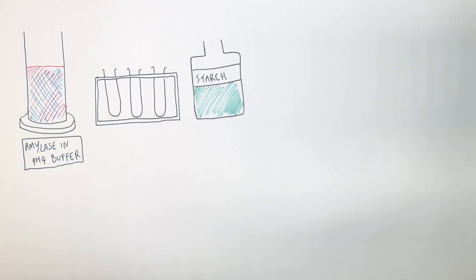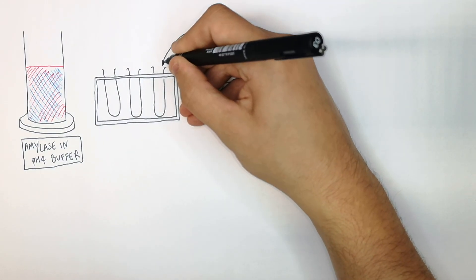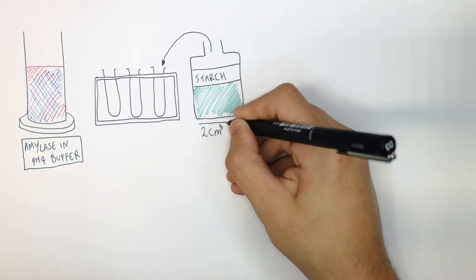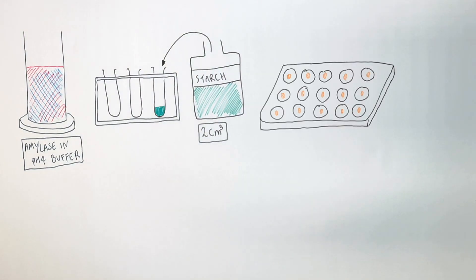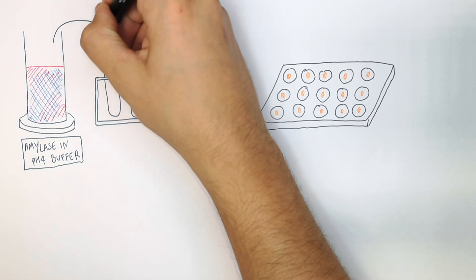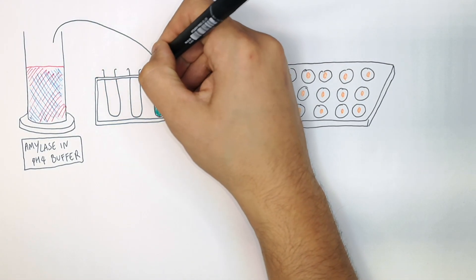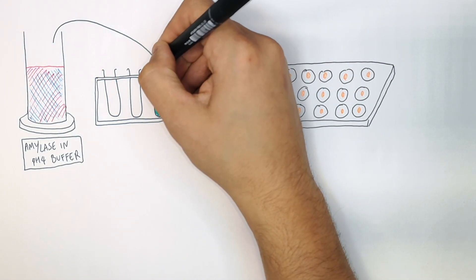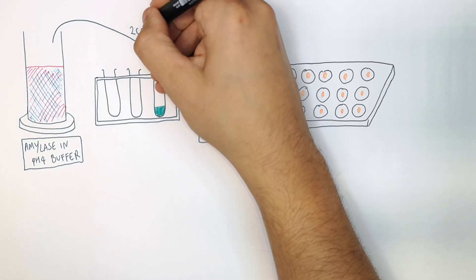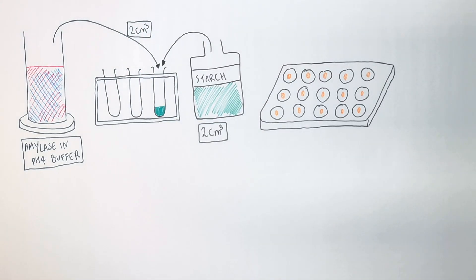Now that you have your amylase in the pH buffer solution, transfer two centimeters cubed of starch into a test tube. Then transfer two centimeters cubed of the amylase in the pH4 buffer solution into the starch.